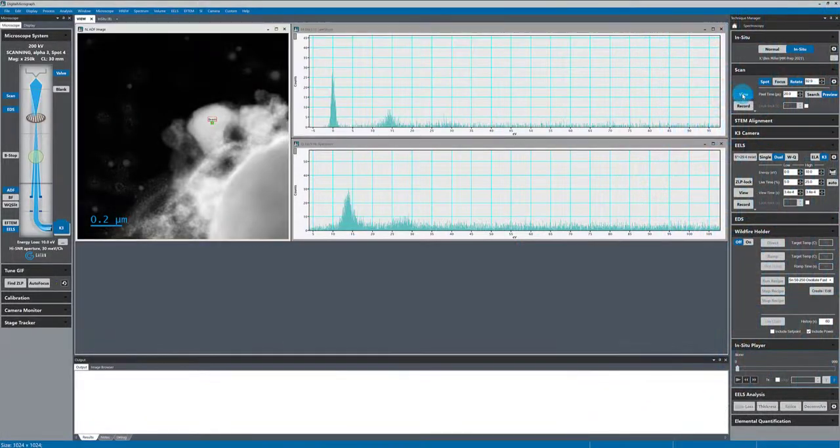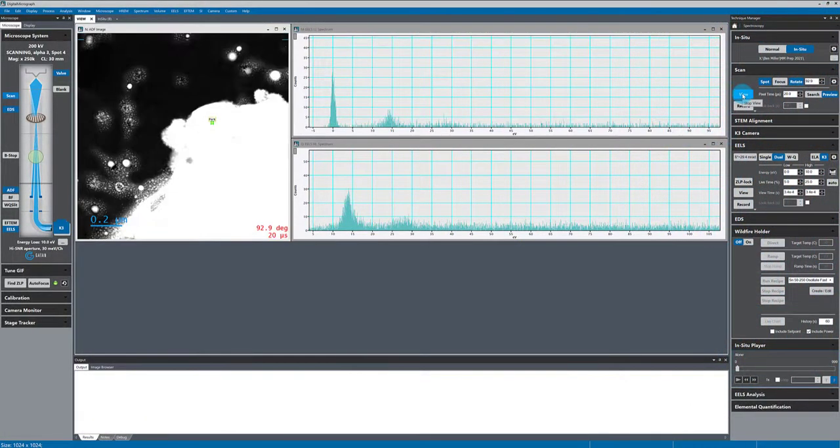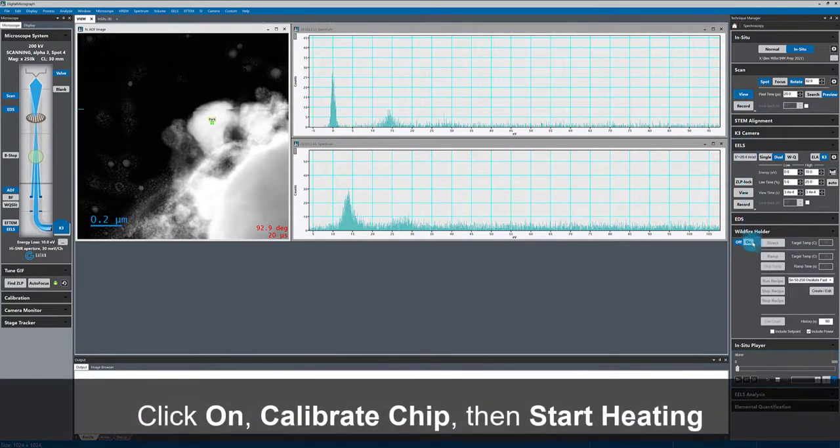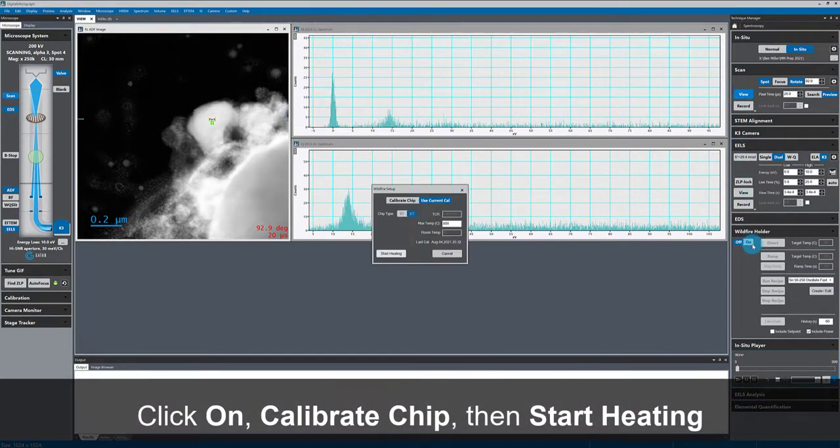In this video, I'll capture some in-situ EELS data and show the updated processing and synchronization capabilities Gatan has developed for the Continuum IS.